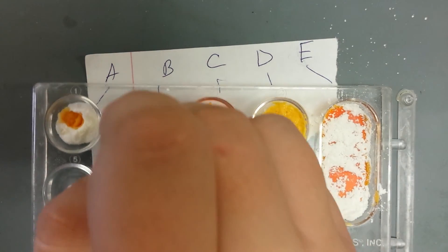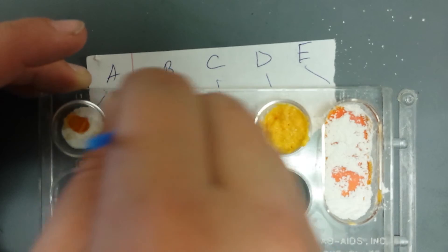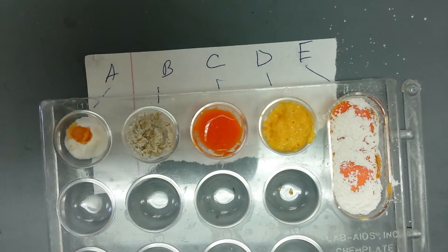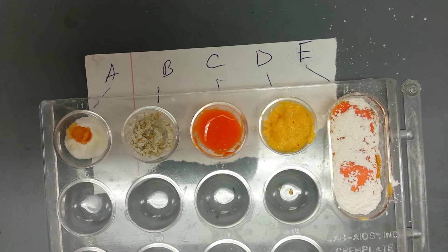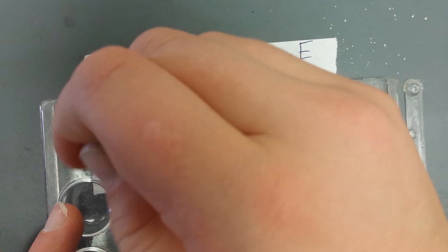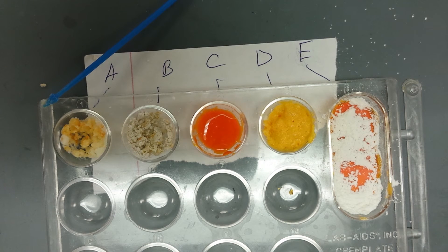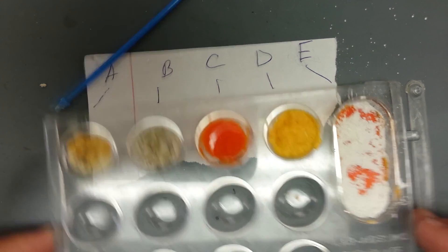Okay. Ready, oh B is like... what? It just clumped. Clumps. Yep, pretty much. I'll do A. Can you wash this off? No, not yet. That one clumps. When mixed, clumps. Translates yellow and clumps. Oops. This turns what? Bright. Hmm? Turns yellow. Yellow and clumps. Let me turn that off. Okay, well we can rinse these out too now.